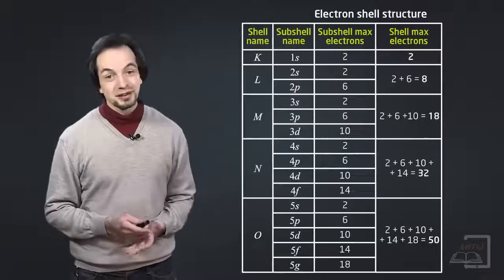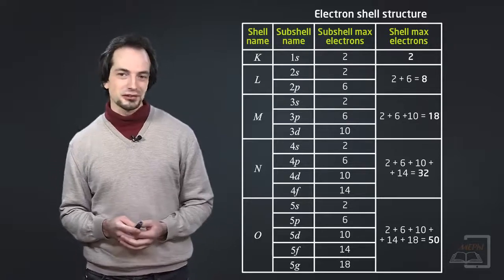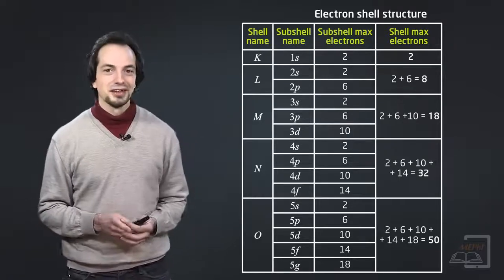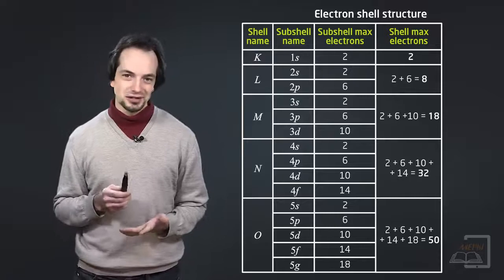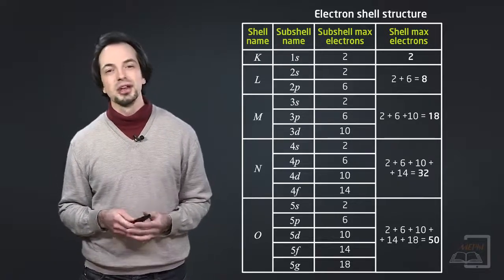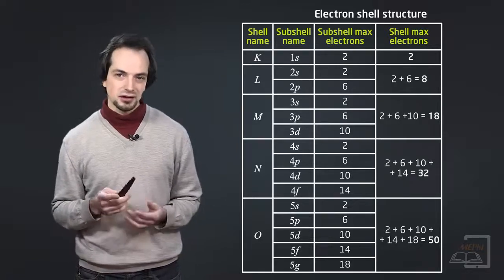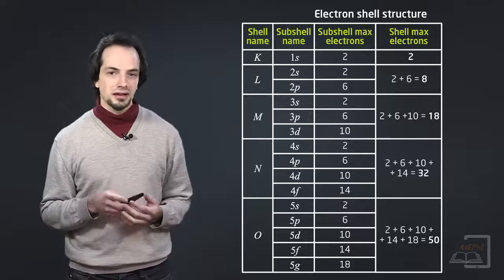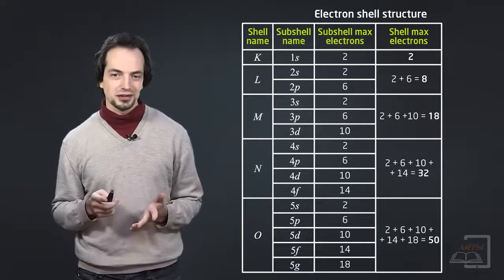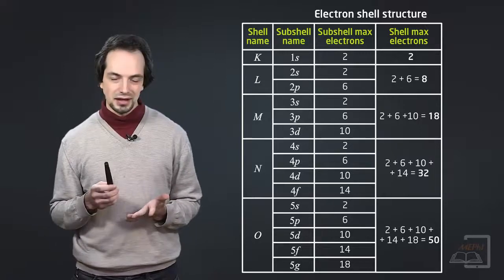It's quite strange, but in all analyzing techniques, the labeling of the electron levels is different. We already know that from Auger electron spectroscopy, the labeling of the Auger electrons. We know that from the EDS method, the labeling of the lines. And in XPS, we also have a different kind of labeling, which goes for the energy levels.